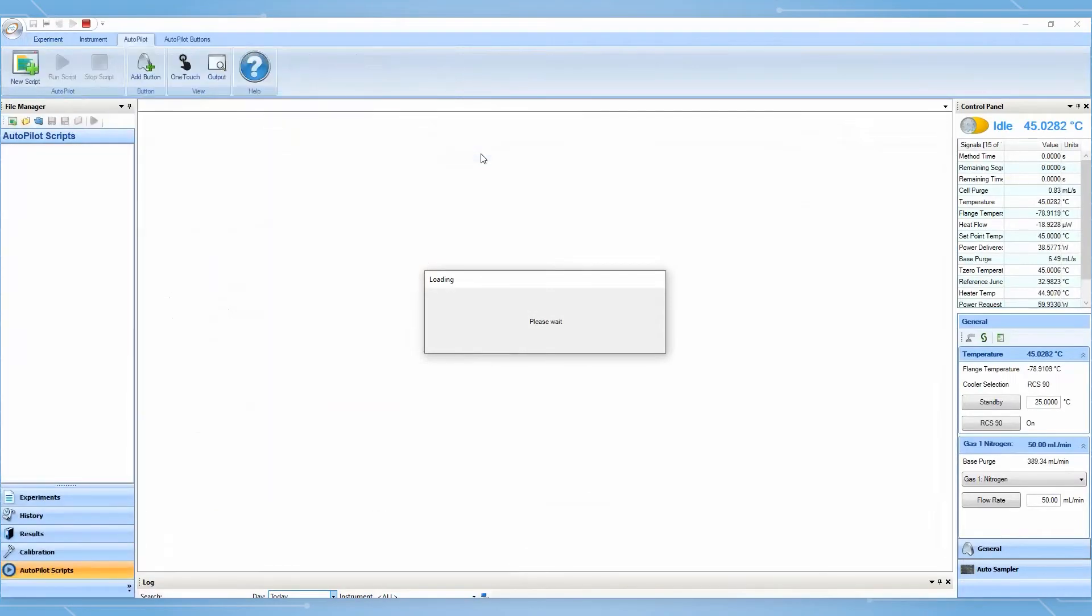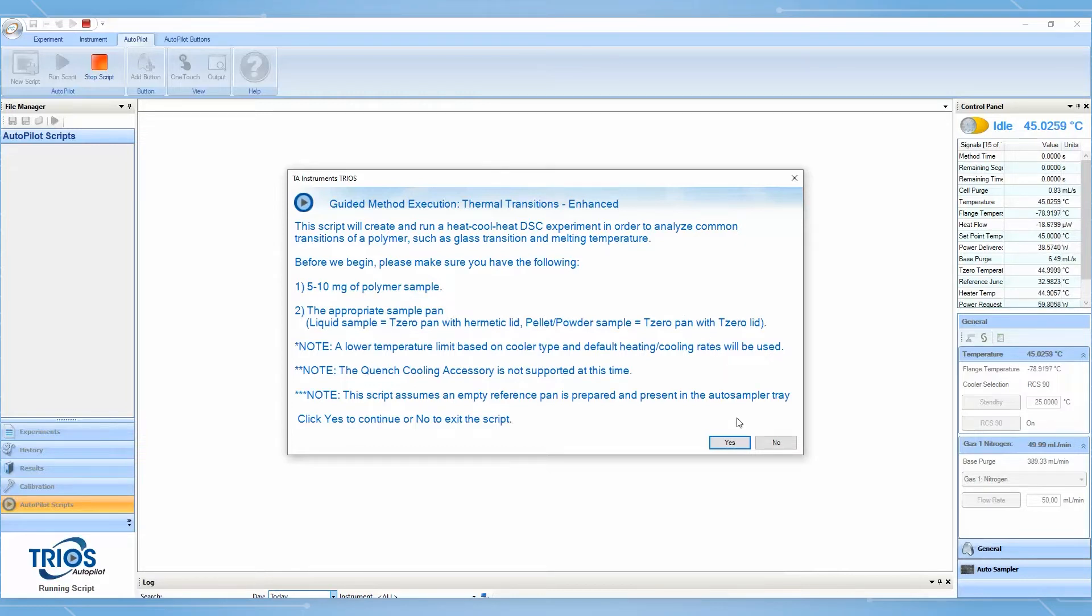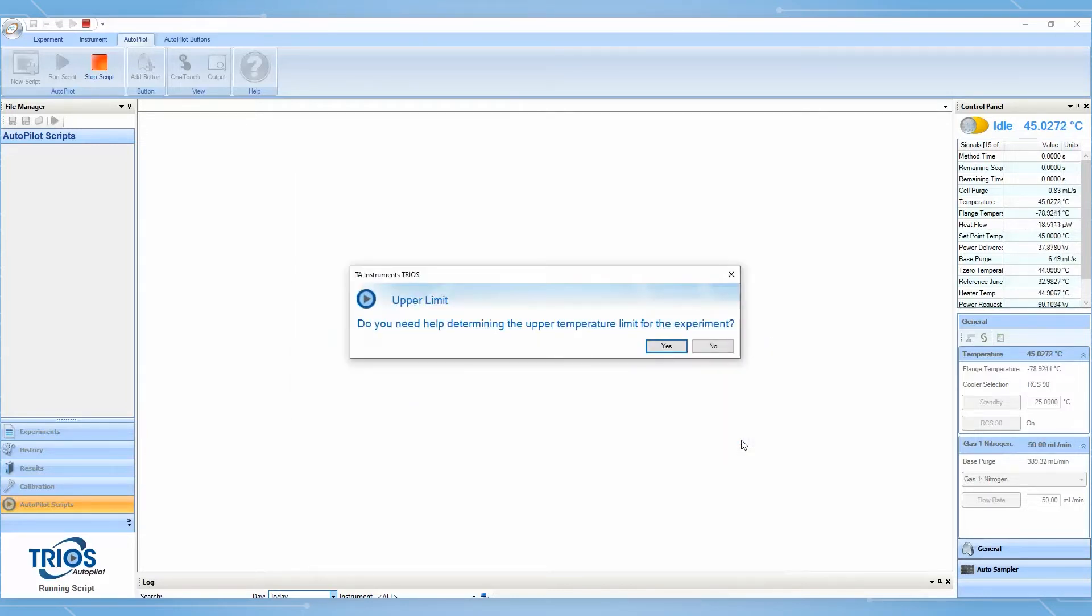With Guided Methods, TRIOS provides a simplified user interface and an instructional framework to reduce training time, reduce mistakes, and reduce user-to-user variability.